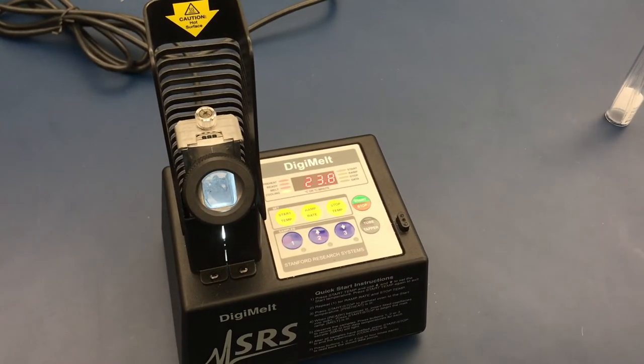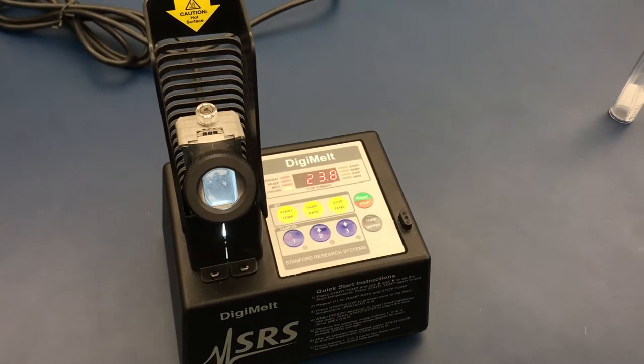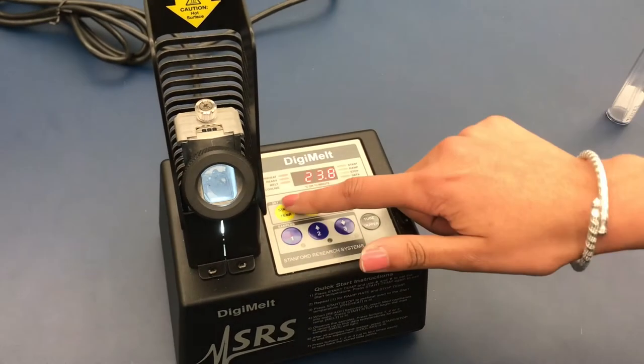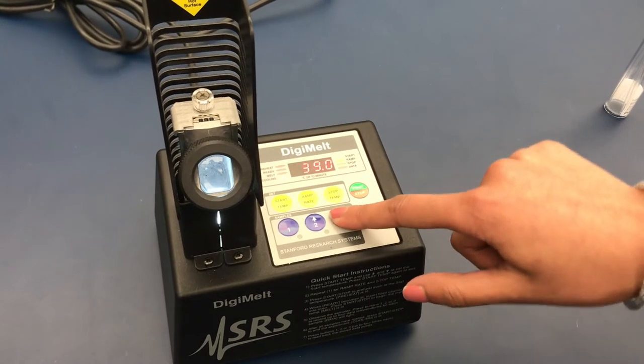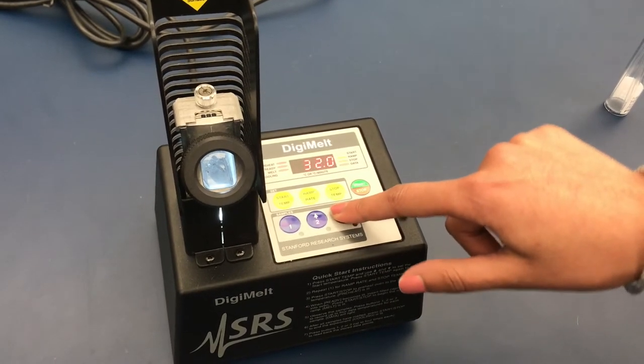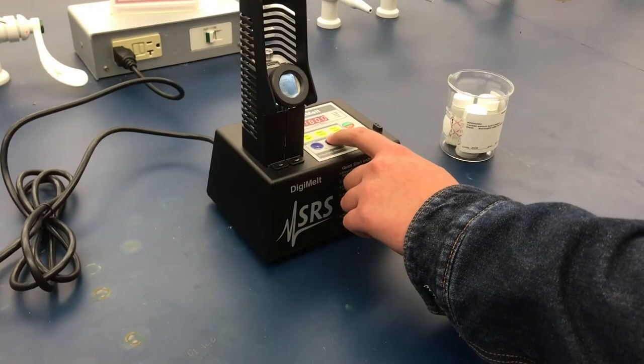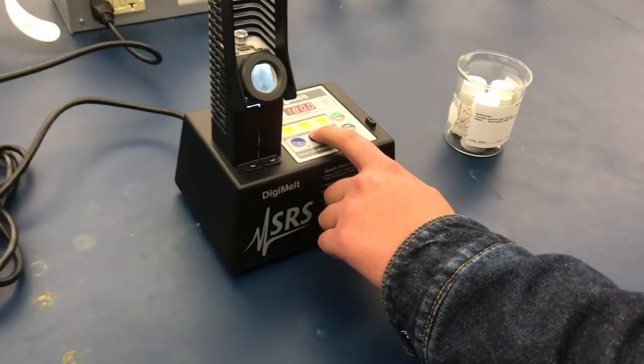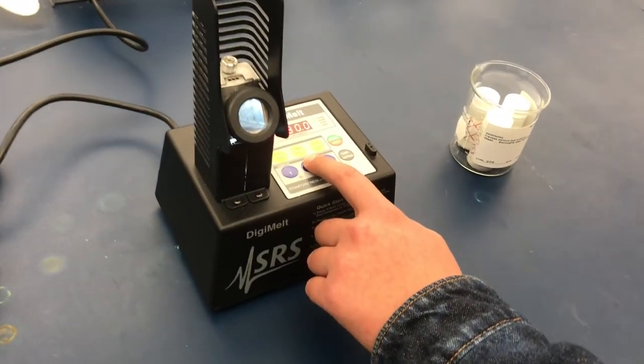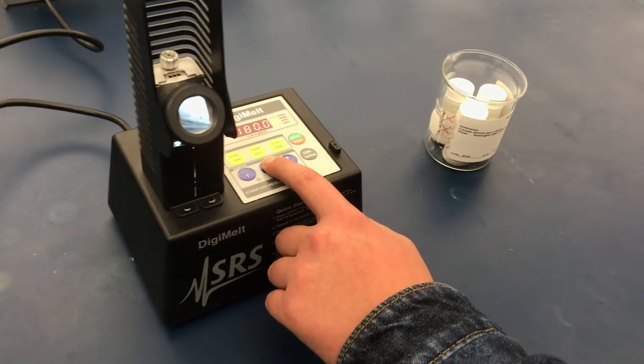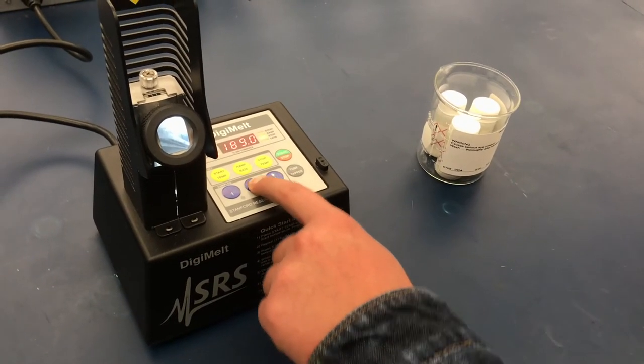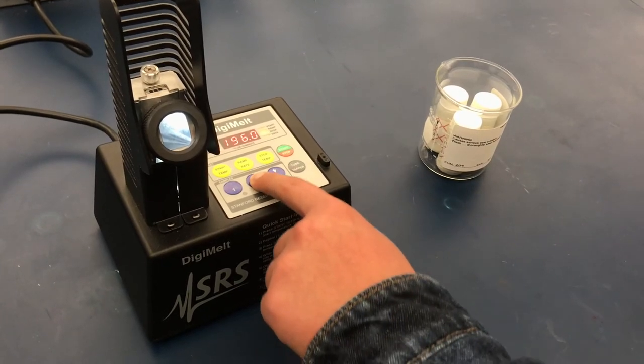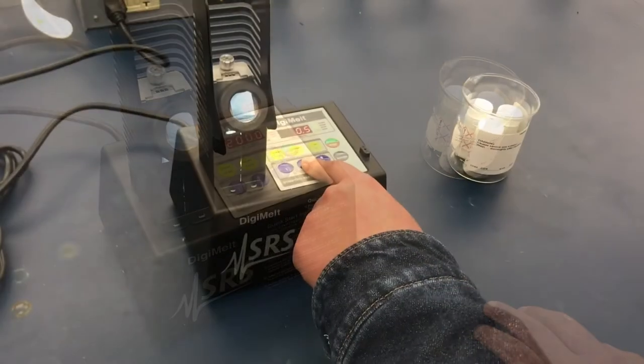You might or might not have an idea of what your melting range will be. If you are unsure, press start temp and press the down arrow until a low temperature number appears. If you have an idea, press start temp and use the arrows to a temperature below the predicted melting range. Next, set the stop temp to a temperature very high using the arrows regardless of whether or not you are sure of the melting range.